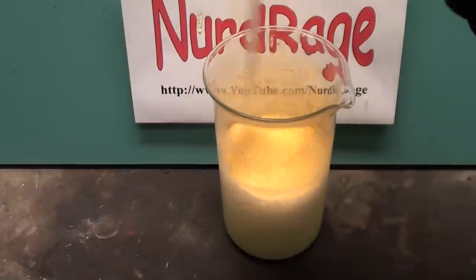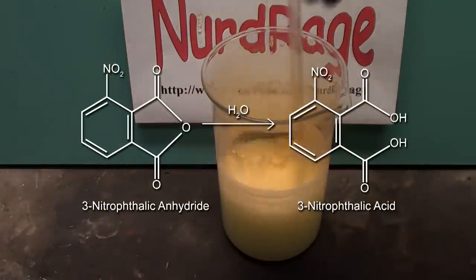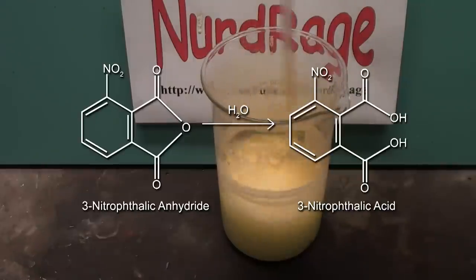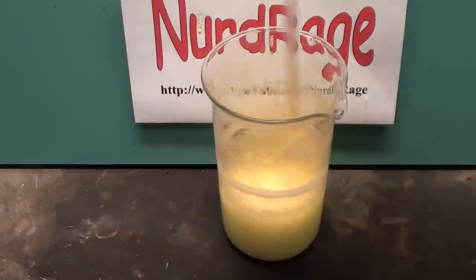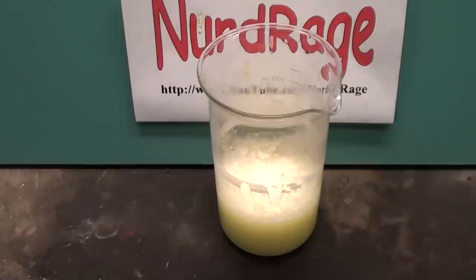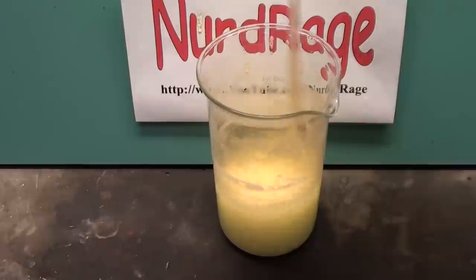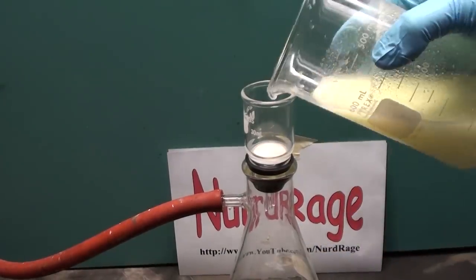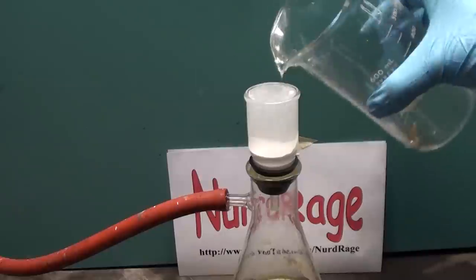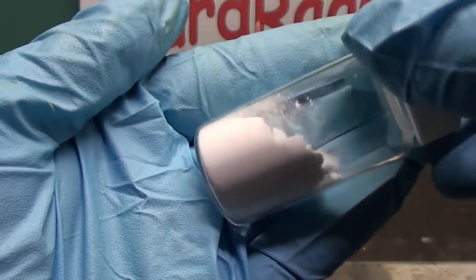Don't add water to the acid mixture as the excessive self-heating is dangerous. Vigorously stir the mixture to break up all the chunks and form a slurry. Nitrogen dioxide will be emitted, so this must be done in a fume hood. What's happening is the mixture is hydrolyzing and the 3-nitrophthalic anhydride is converting to 3-nitrophthalic acid. More importantly, we're separating it from various other components such as sulfuric acid, nitric acid, sodium sulfates, 4-nitrophthalic acid, and various other organic side products. Most of them are very soluble while our 3-nitrophthalic acid has lower solubility. Allow the mixture to stand overnight so it fully hydrolyzes. Here we are the next day — shake and then vacuum filter the mixture. Wash the residue with two 50mL portions of water and allow it to dry under an air stream. Scoop it out into a container — that is 3-nitrophthalic acid.